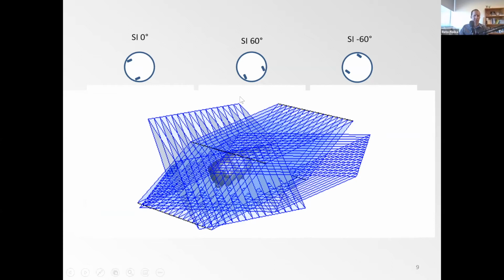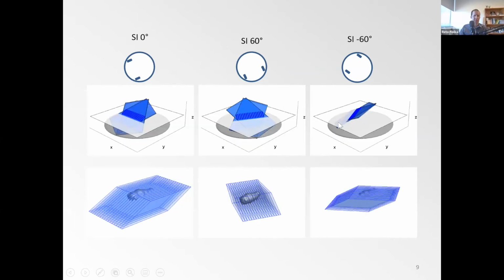And so this problem I outlined before, how you can, in a light sheet format, rotate the illumination pattern or the light sheet, can actually be solved quite elegantly in the oblique plane microscope case, whereas in a classical light sheet, it would be quite a headache.